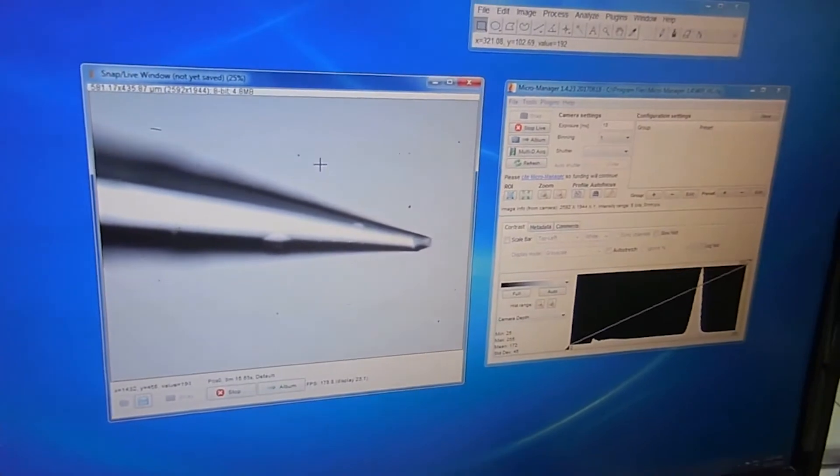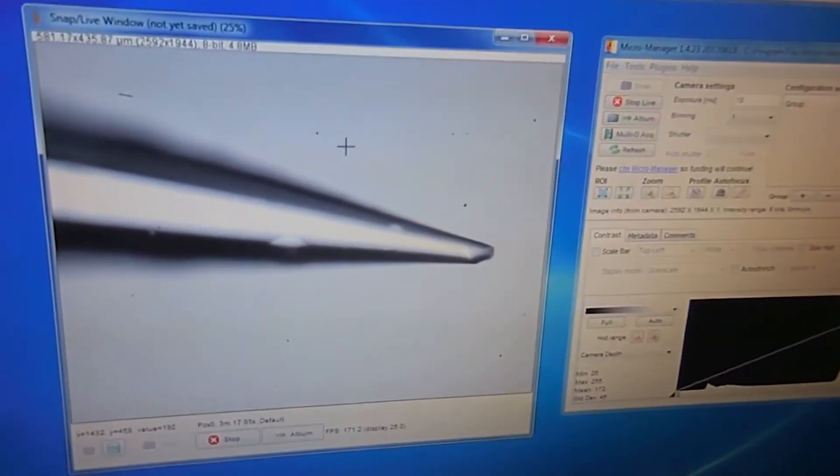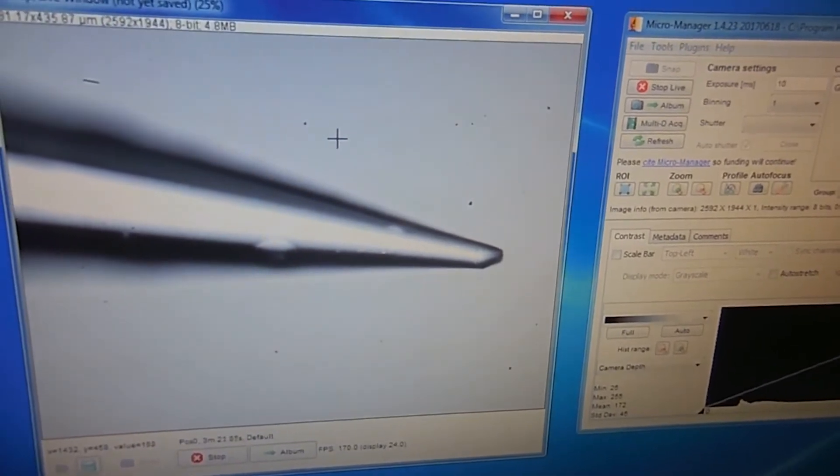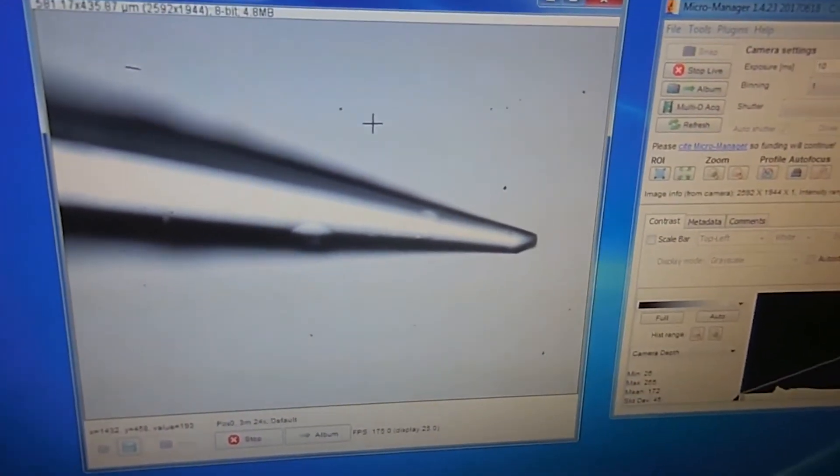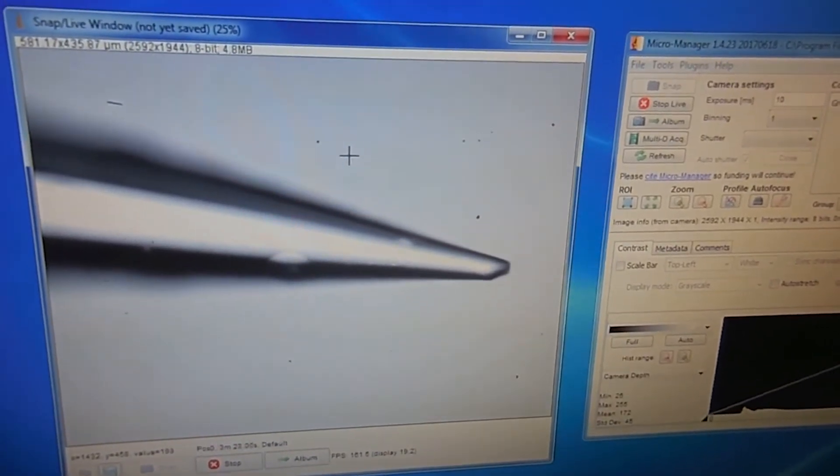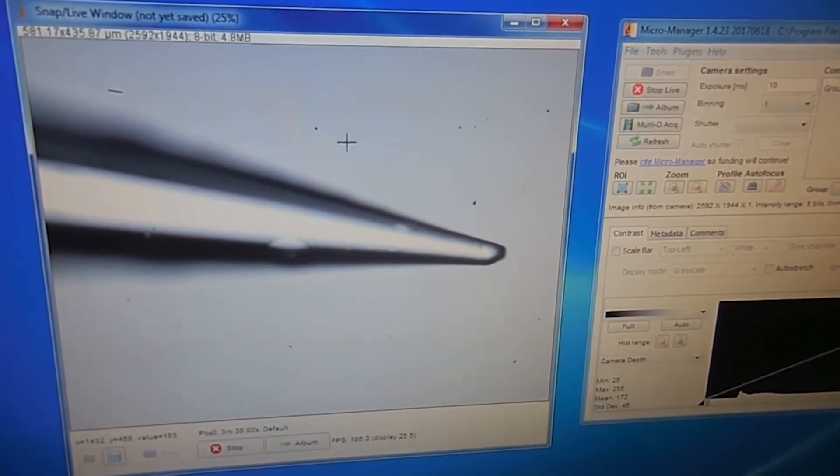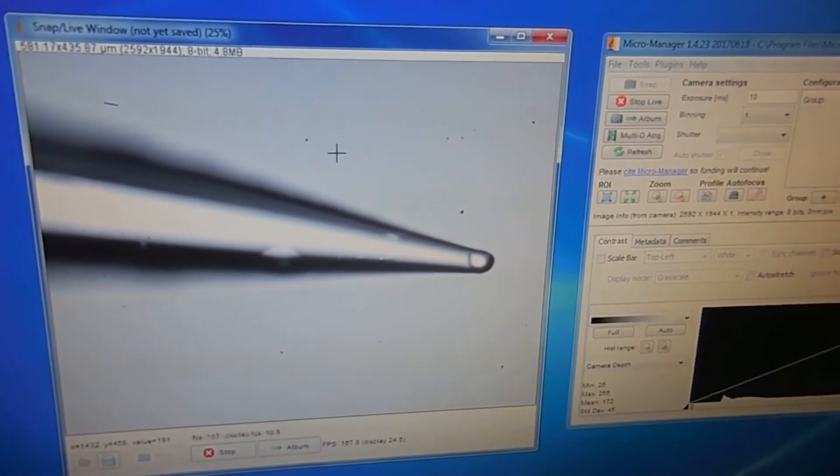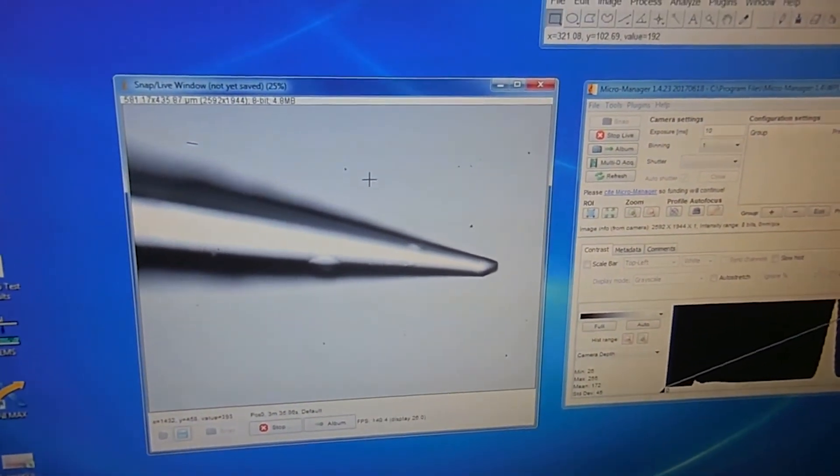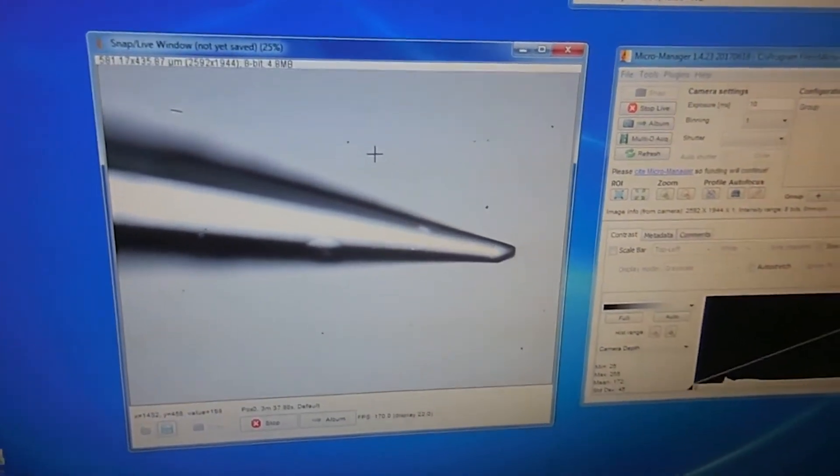Now I'm going to very carefully adjust the hold pressure until the meniscus reaches the tip and doesn't leak out. So that when I flip back to vacuum, I can see it pull back and go forward. And if I put a little bit too much on there, you'll see a little bubble come out, that's too much. I'm going to back that off and set that. So that's almost a perfect setting for the hold pressure.